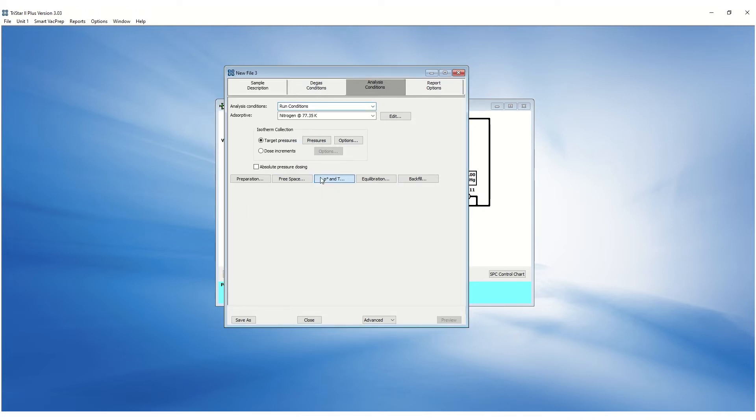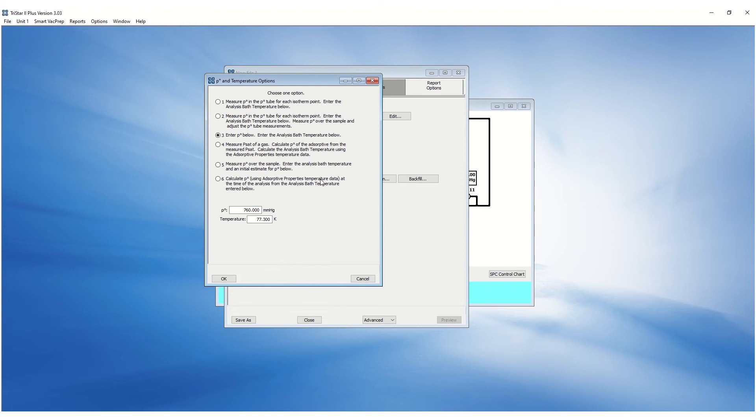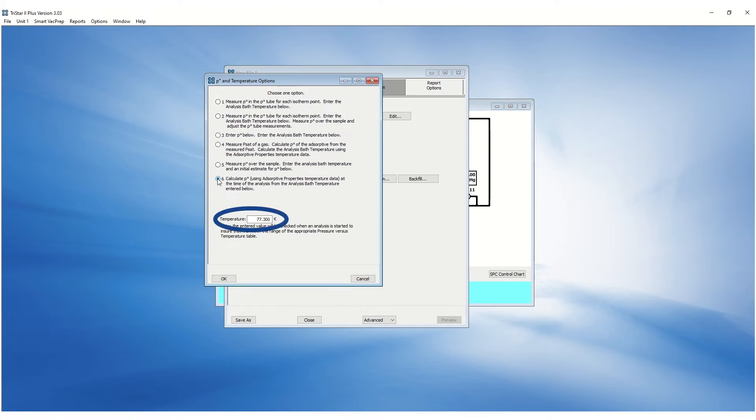P0 and temperature options provide different ways to measure, enter or calculate the saturation pressure. The analysis temperature is entered here.